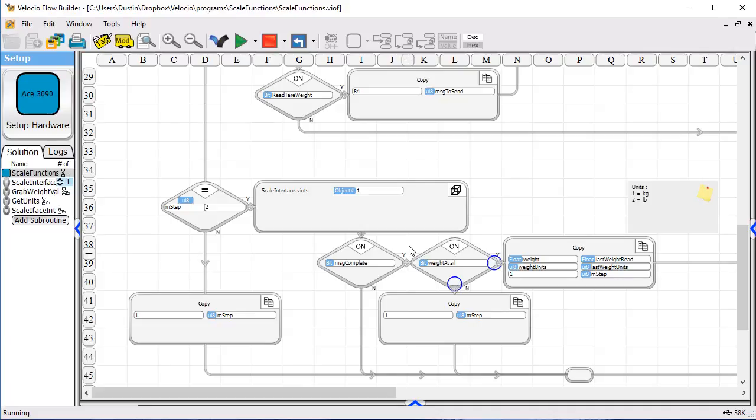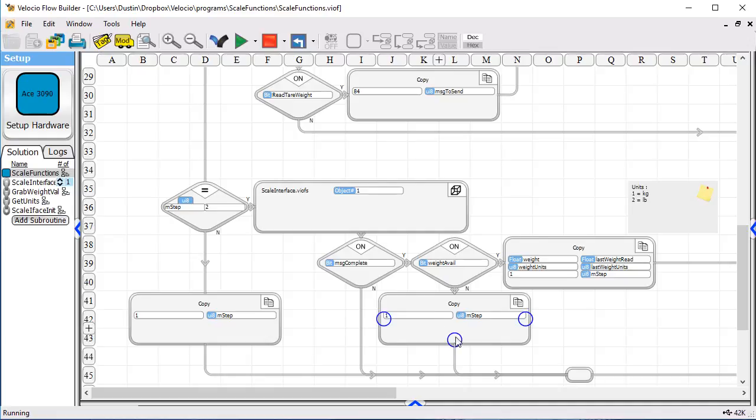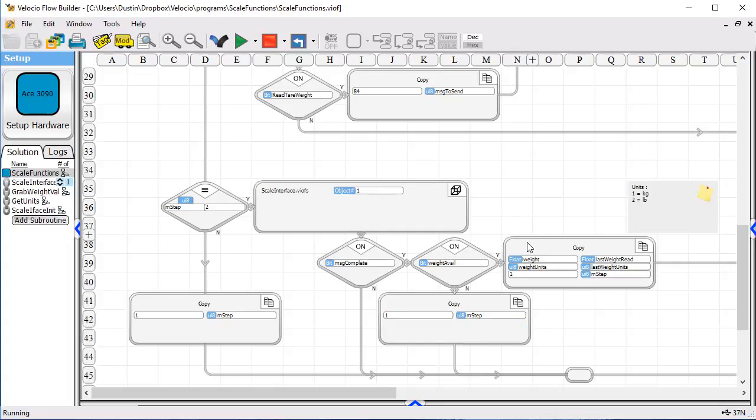If it's not a weight read, which is something that would happen if you are doing a zero tear, then we've got a message that's complete and weight is not available. In which case, we simply go back to wait for the next switch. When we do get a weight reading, we also copy a one into M-step here too. We go back and wait for the next operation.